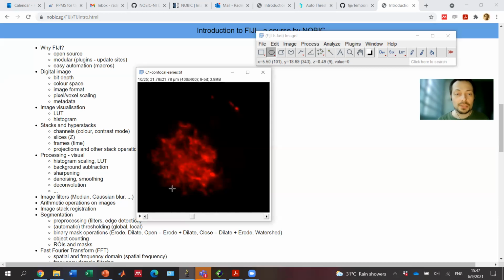So in this case, because this is a sample from FIJI, for which I don't have the complete metadata, which would tell me what objective was used, what the wavelength was, all the data which are needed to estimate the point spread function, I cannot do deconvolution. I can do something else. There are alternatives to deconvolution which use artificial intelligence.